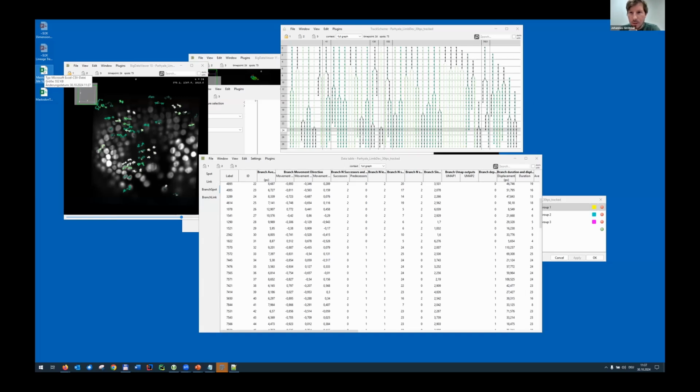Yeah. And also, Dean Renmer mentioned the Jupyter Colab analysis tool. He says this is available since yesterday. I think it's basically the PLOS Biology paper, CellTrax Colab, and I will add the DOI. It was from the beginning dealing nicely with TrackMate. So you could use this Jupyter notebook and it would know the TrackMate export, and you could directly export from TrackMate and ingest this into the notebook. I think it's possible that this has been optimized further now, so something may have changed. But it's totally possible to use this CellTrax Colab. So that's also an interesting platform.